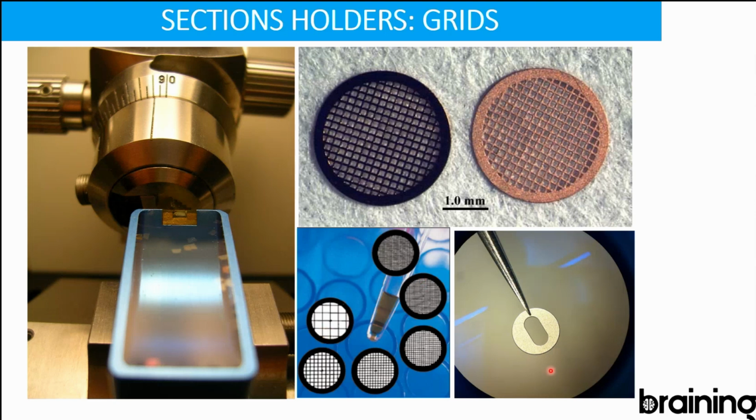But I prefer this one that you have on the bottom, because as you see, I have just one hole, and I can actually see my entire sample in just one look. But since this is one hole, I need to use a support membrane that I have to make on my own, to make sure that I don't lose my samples through the hole. So I need some membrane of support to get my sample on it.